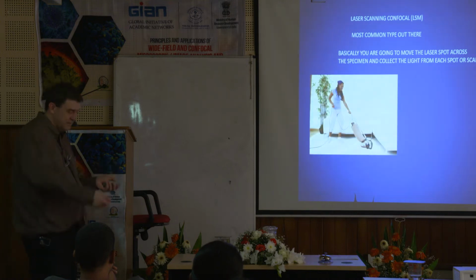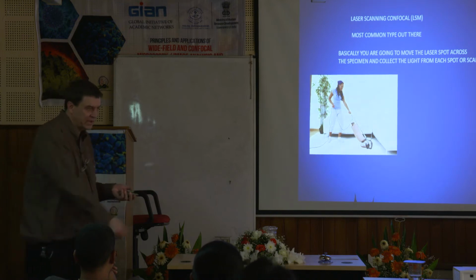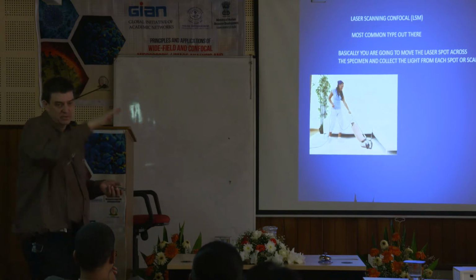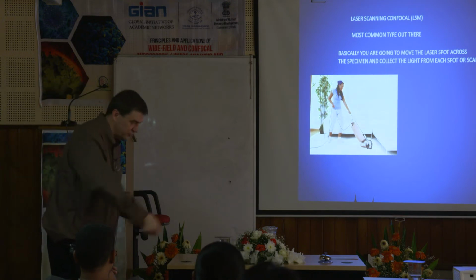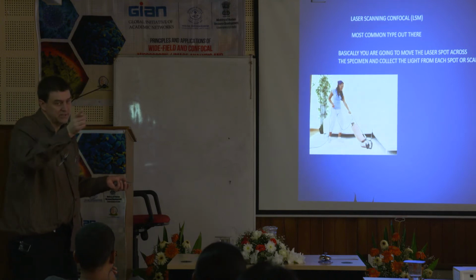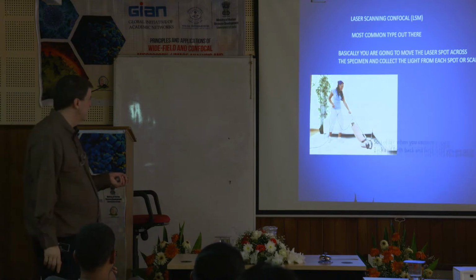Okay, it's like this. It's like, if you sweep the floor with the broom or whatever, you go back and forth, back and forth. Well, same idea. You're going back and forth across your image or your specimen to collect your image. Okay? And again, think about that back and forth, that's a lot of laser hitting that thing. Phototoxicity, photo bleaching, right? Okay.